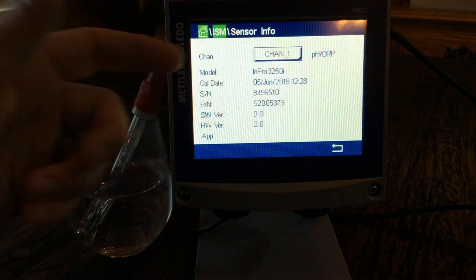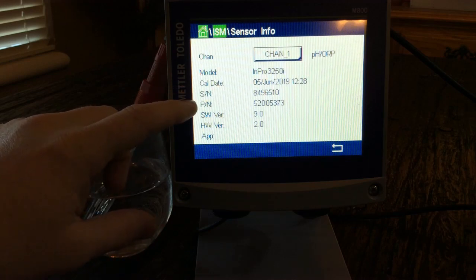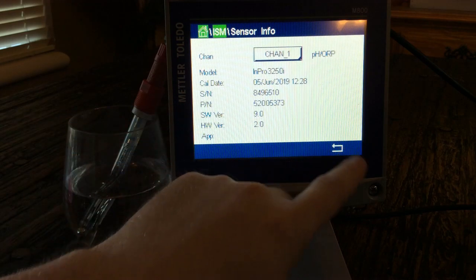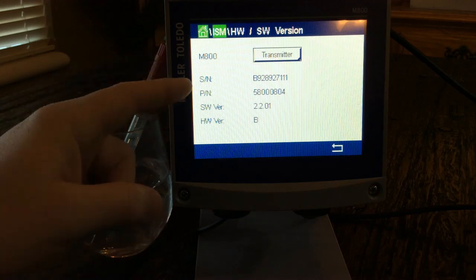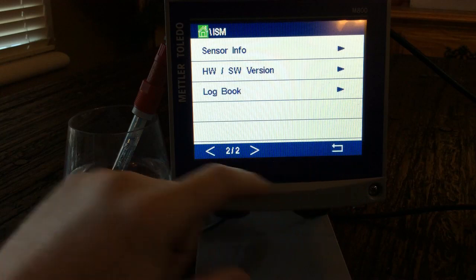SensorInfo is very useful — if you have a sensor in the process and need to replace it but don't know the part number or when it was ordered, you can come here and see the serial number and part number, then call to get it ordered. The same goes for the hardware transmitter — part number and serial number are right there.